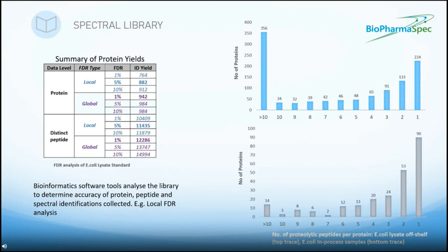So what we're doing here is showing how representing the data in this way and monitoring for this is a useful way to assess the quality of a library, and something to bear in mind as a guide during the planning process for your analysis.